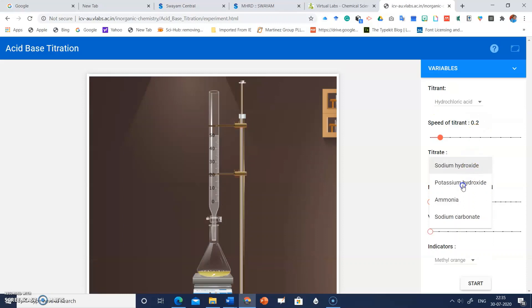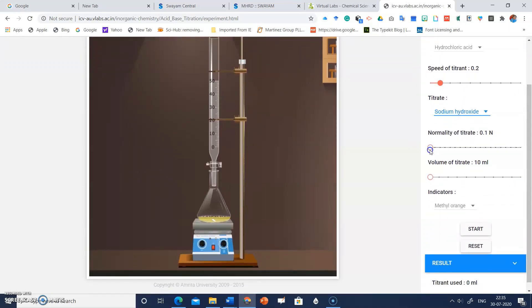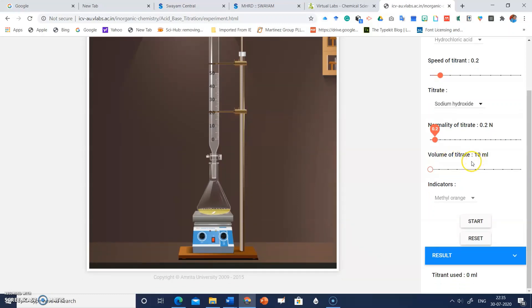For the titrate, there are many options: sodium hydroxide, potassium hydroxide, ammonia, sodium carbonate. I'll go with sodium hydroxide. You can also select the normality of the titrate — 0.1 N, 0.2 N, or 0.3 N. Let's take 0.2 N. The volume of titrate can also be adjusted; the default is 10 ml, and you can change it to 11, 12, 13, 14, or 15 ml.